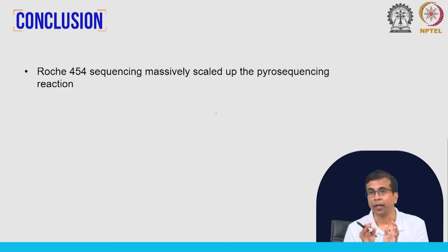So, it does not depend on the base itself; you end up with a light signal whichever the base is, and this light signal can be detected, and this indicates there is an addition of a base to the complementary strand that is growing. This light signal then acts as the detection across these wells. If you can visualize in your mind, across the picotiter plate the detector is seeing these signals of light as the sequencing reaction is going on, across these 100,000 wells in the picotiter plate. And from that it is doing the base calls.